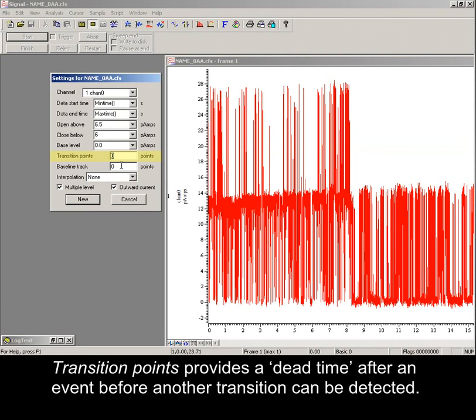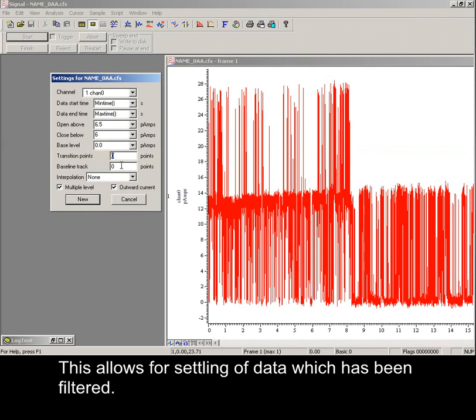Transition points provides a dead time after an event, before another transition can be detected. This allows for settling of data which has been filtered.